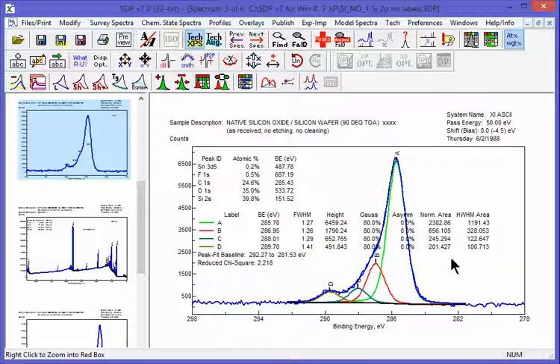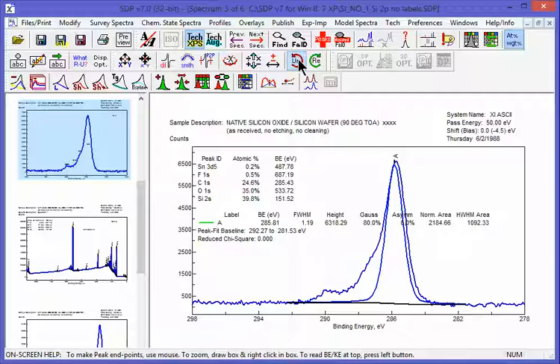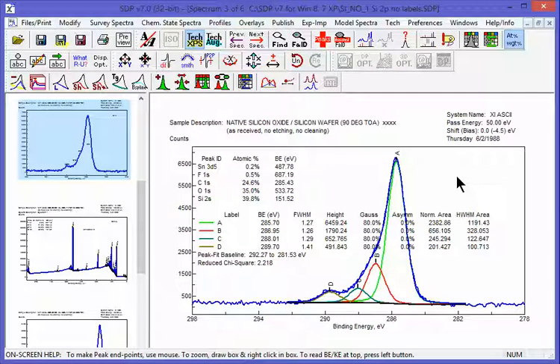And now I can undo things and hide things. Let's undo things. Undo, took out that last peak. Undo, took out that peak. Undo. And then I can bring them all back, as I please. Let's do a little scaling.